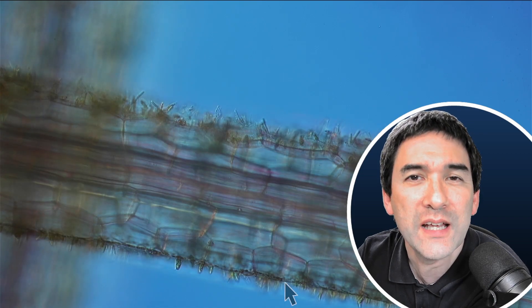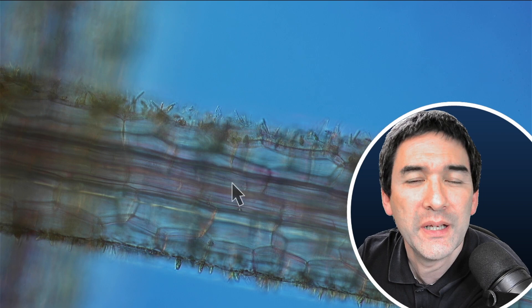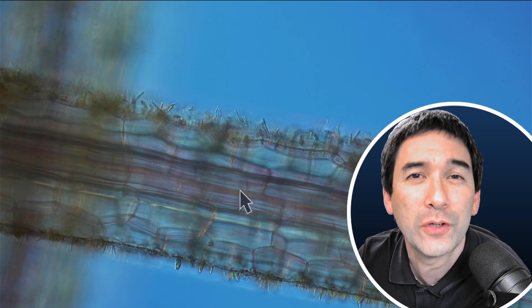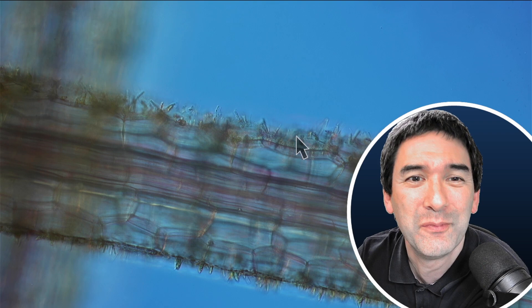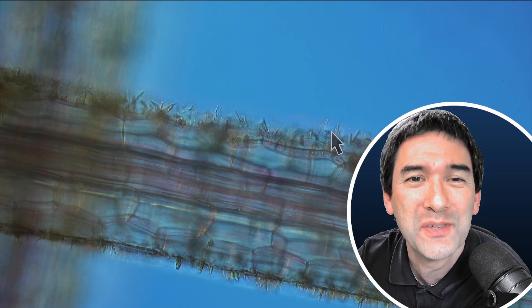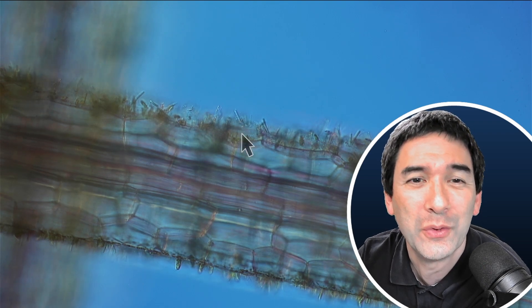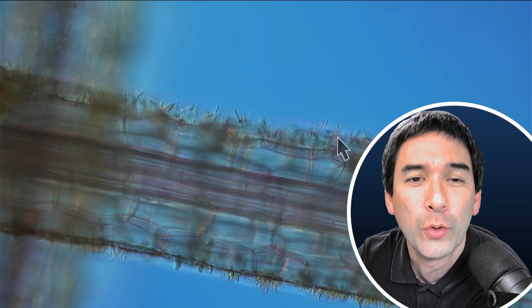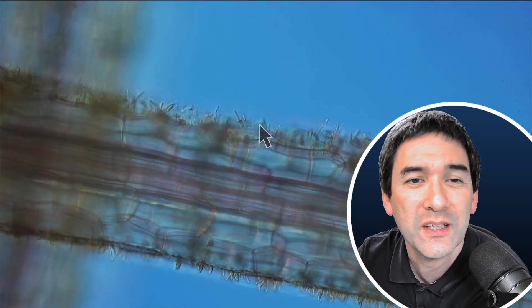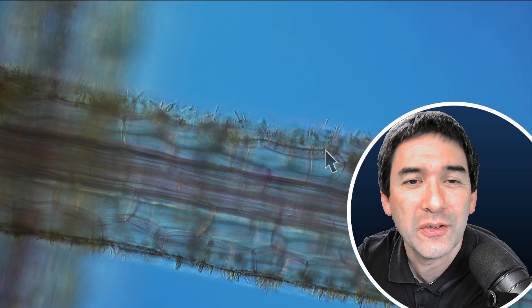This shows that the algal filament must have been in the water for a longer time to give sufficient time for the cyanobacteria and other organisms to grow on here. So what we have here is actually a so-called biofilm forming on the surface of this filament.